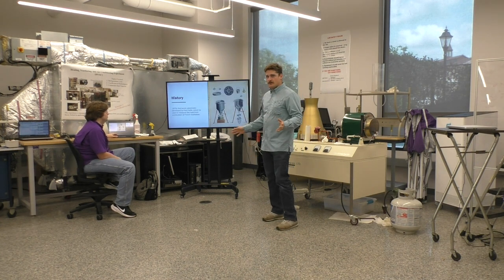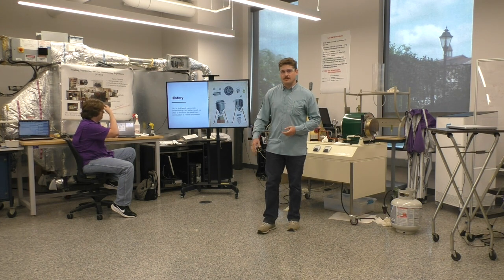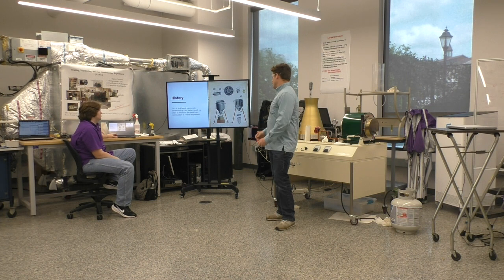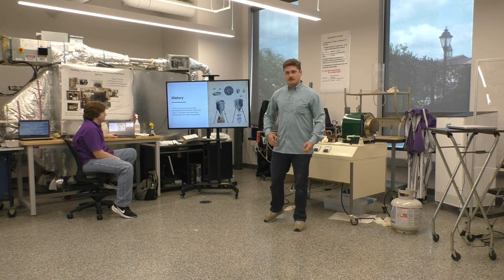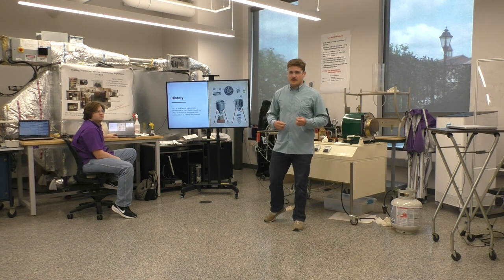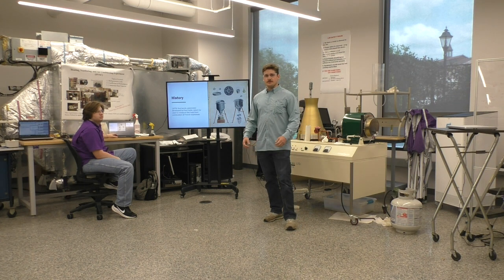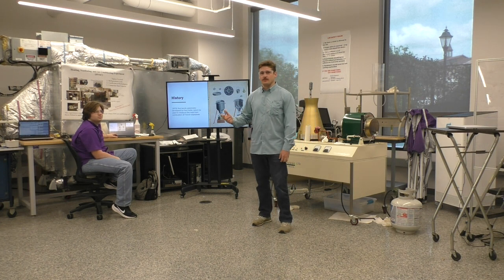So, a little bit of background. Our history is that in 1878, the first bomb calorimeter was created by Paul Vieille, and he used it to measure the heat from combustion of French explosives. We had to find a way of how much energy is in a powder, in a substance. And so today it's basically used to create calorie ratings for food.